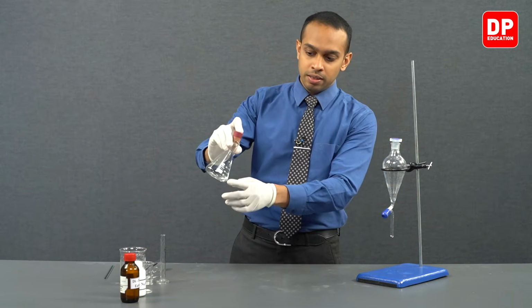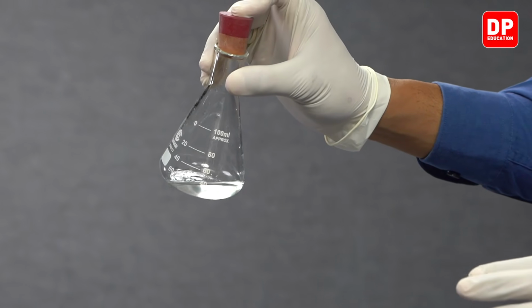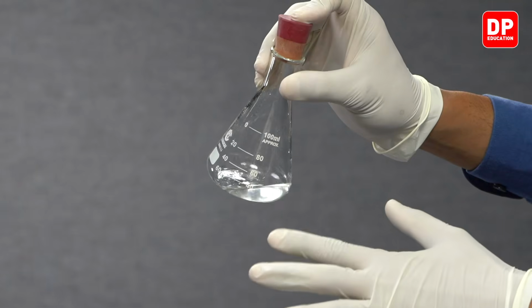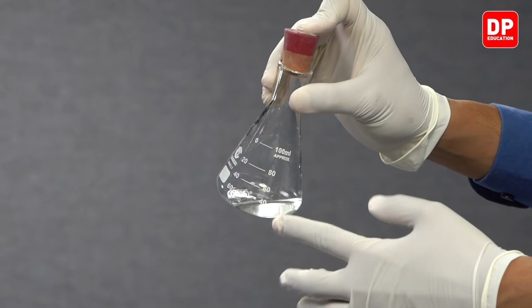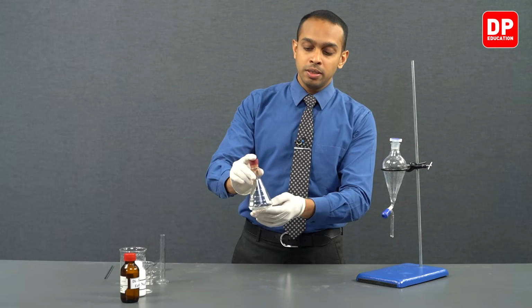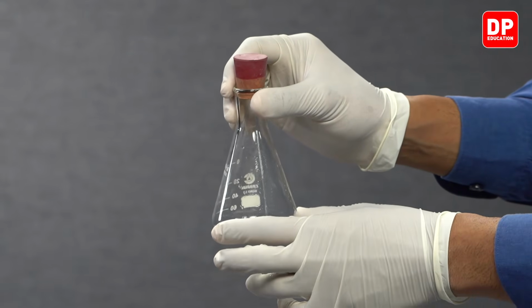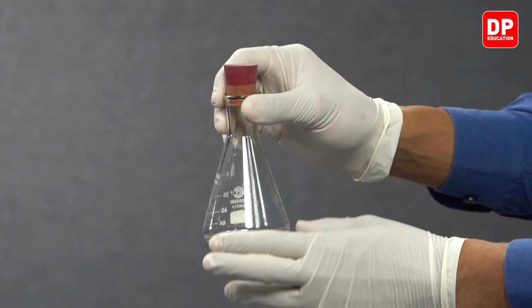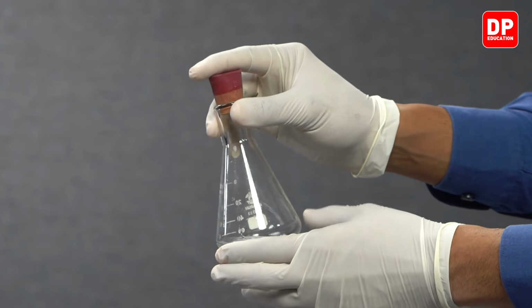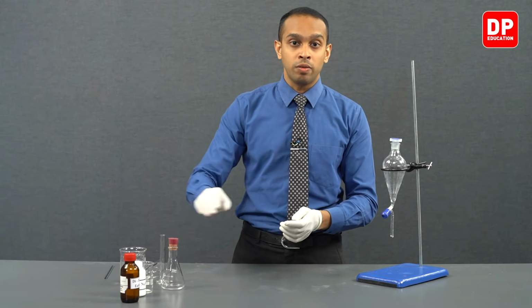Now you can see we have two 10 milliliter portions of our diethyl ether layer collected here in this Erlenmeyer flask. We will place a rubber stopper on this Erlenmeyer flask so that the diethyl ether that we have taken into this flask won't evaporate as we carry out another solvent extraction.